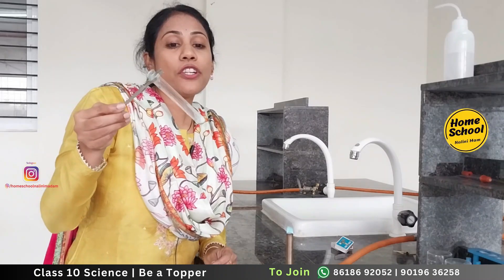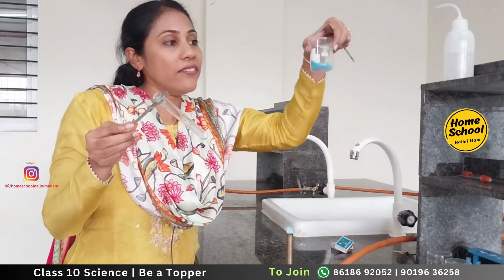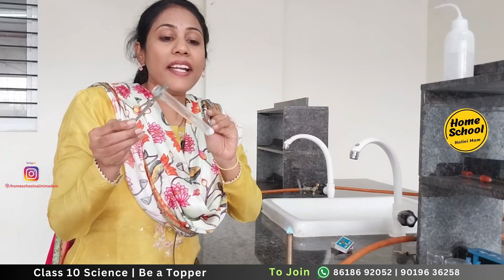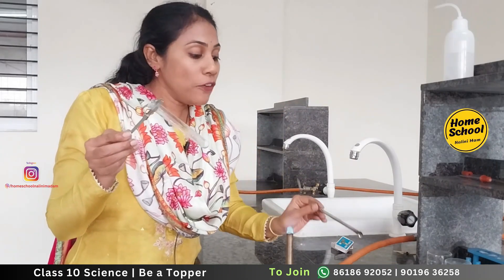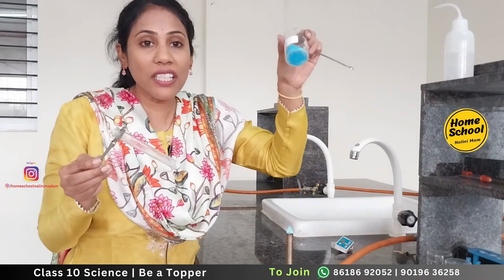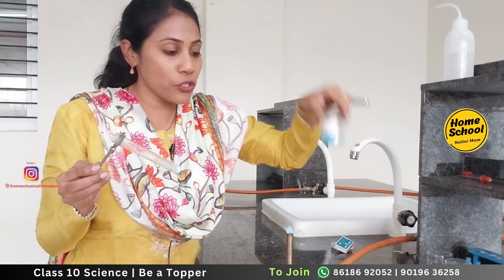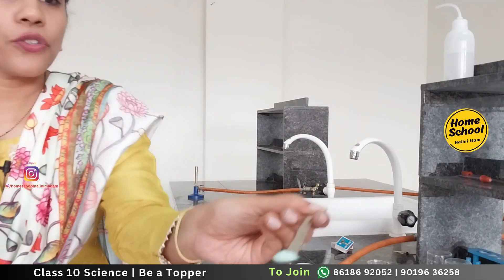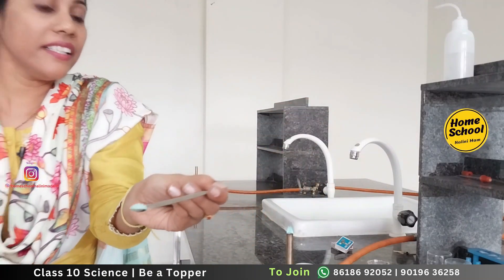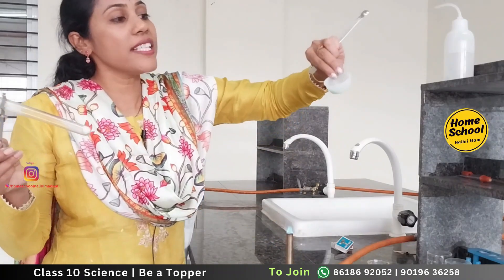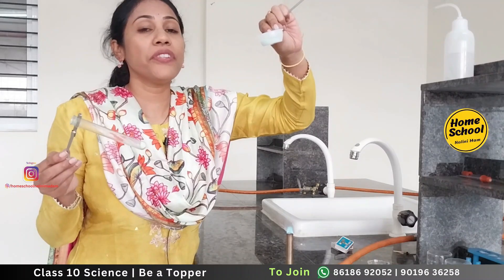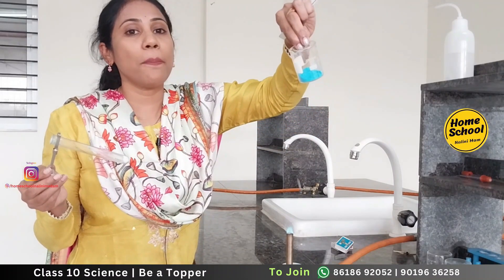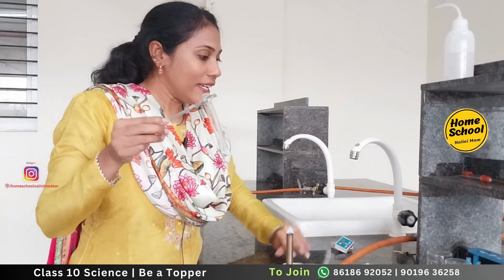From the blue color crystals all the water got evaporated, and that is how the blue color became colorless. You can clearly see the water droplet formed inside the test tube — this is the evaporation of water of crystallization. Water of crystallization is also the reason crystals have color. Iron sulfate crystals are light green because of 7H2O present with each molecule, and copper sulfate is blue because of 5H2O.